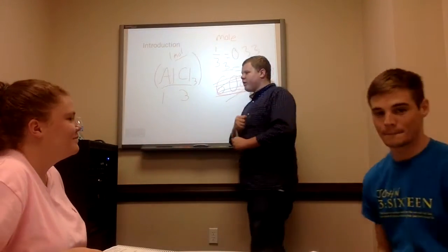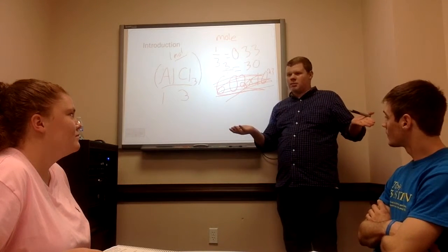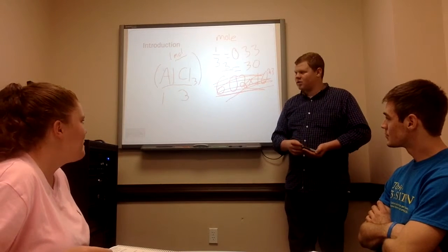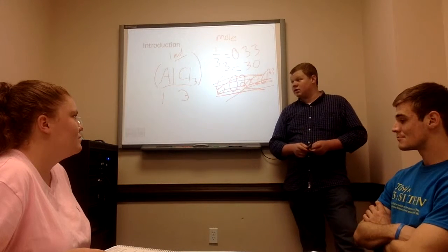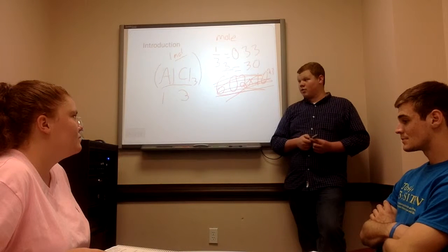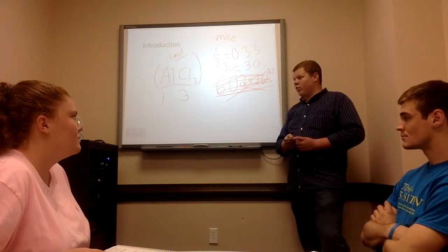So, if you don't know the formula of a particular compound, you might think that you're up a creek without a paddle. But if you know the molar ratio of 2 elements in the compound, you can use that ratio to determine the simplest possible formula for the compound, which is what we're going to talk about today and do in the lab, the empirical formula.